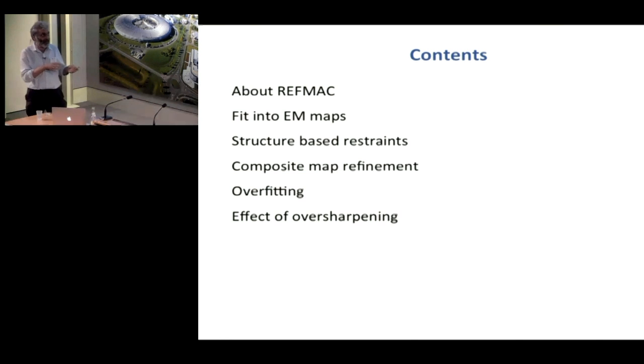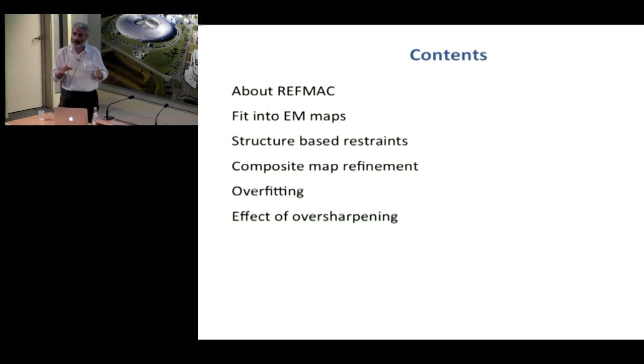Here I will give some of the tools within REFMAC that can be used to fit atomic models into high resolution EM maps. At the moment, so far, we are using all these tools using scripts.